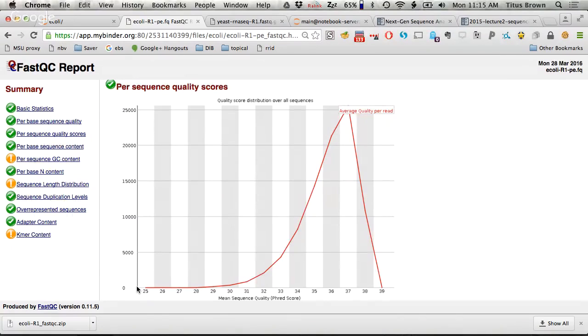So as soon as you apply a fairly stringent filter, you get rid of a lot of the sequence that's dragging down your average qualities. Essentially, you're not seeing many sequences that have a few bad bases that get truncated but are mostly good. It's mostly a situation where you're throwing away a lot of the bad sequences with that one filtering step.